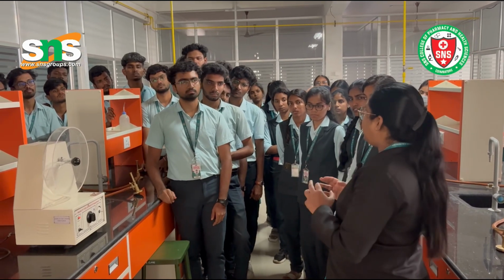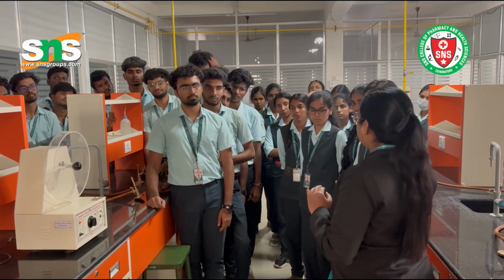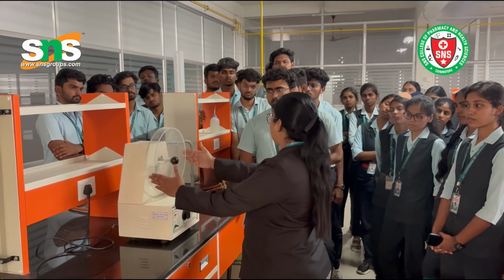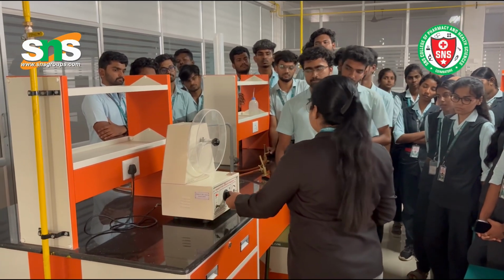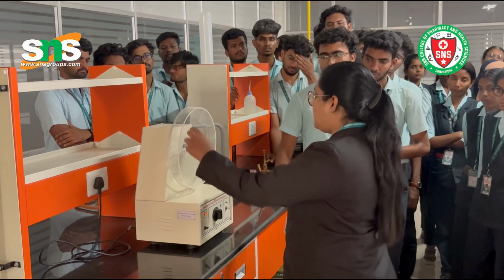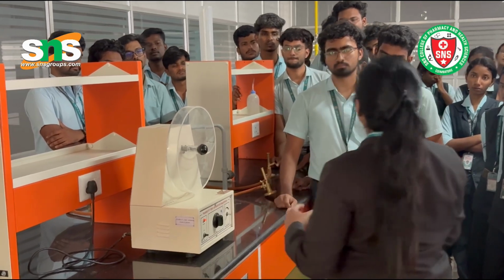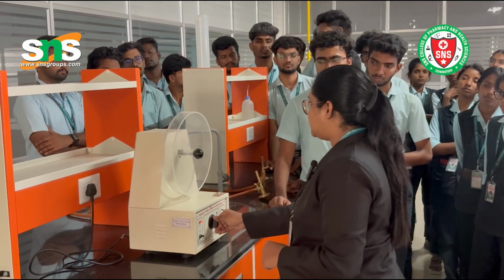We'll take 10 to 20 tablets and take the initial weight of those, and we'll put them into this drum. This is the drum. Can you all see this? This is the drum, this is the on-off button, and this is the speed adjuster. You have to put tablets here. This is the paddle, this is a supporter. In this we need to put the already weighed 10 tablets. Now you have to start this.